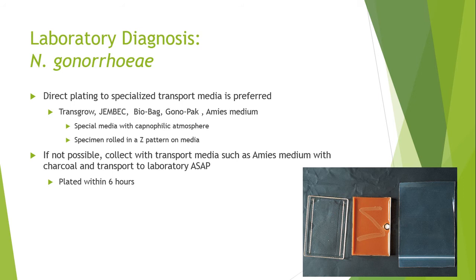And if you notice, that little round pellet is something that will convert oxygen to CO2. So once you inoculate your media, you stick it in the bag with the pellet in there, and it'll convert it to a CO2 environment, because gonorrhea is a capnophile that likes CO2, and then transport it to the lab, and they'll do their thing with it.